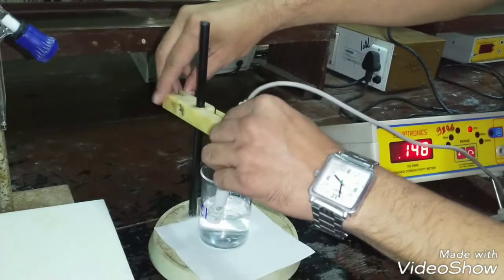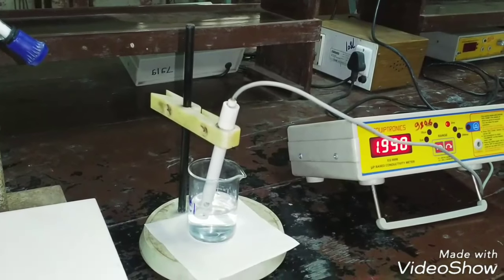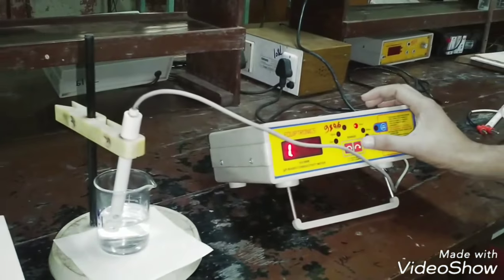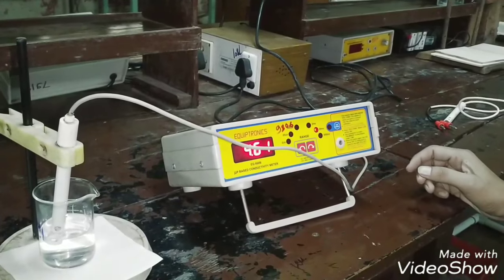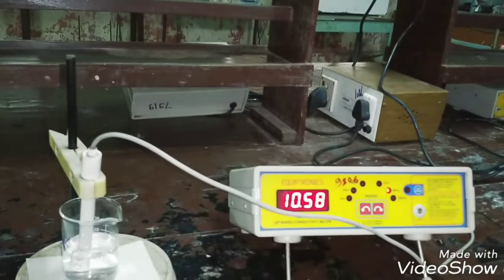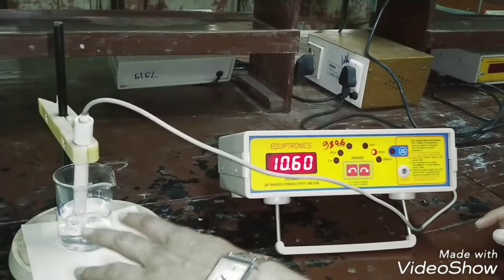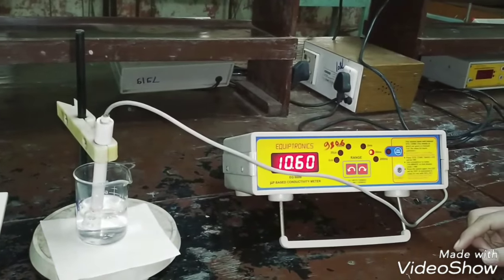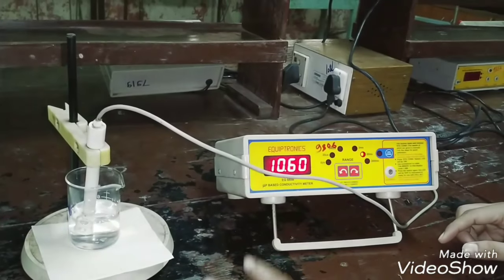Initially the conductivity of HCl is very high because the HCl is highly ionized acid. The HCl is highly ionized acid and in solution it forms H+ and Cl- ions.